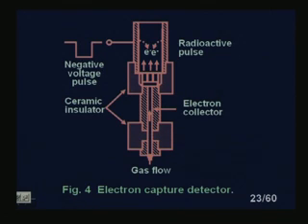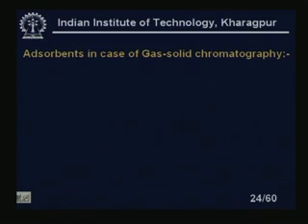Okay. So, this, you see, is what we are talking about, the electron capture detectors. Let us now go back. Now, adsorbents in the case of gas solid chromatography.